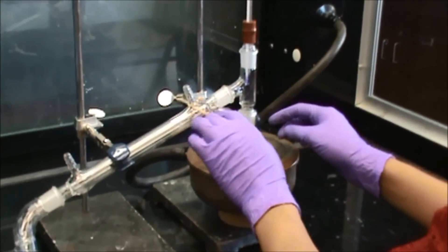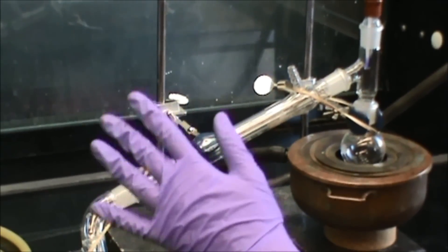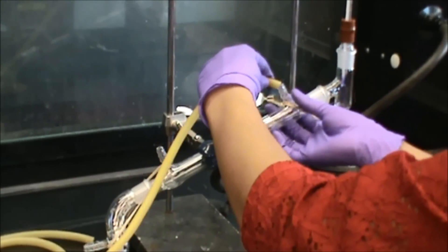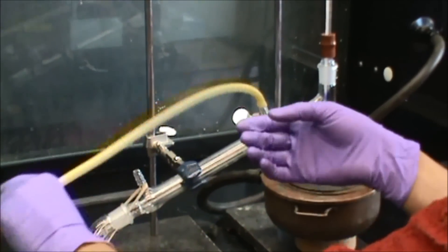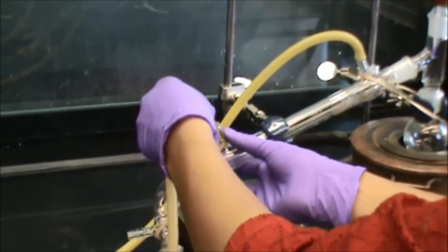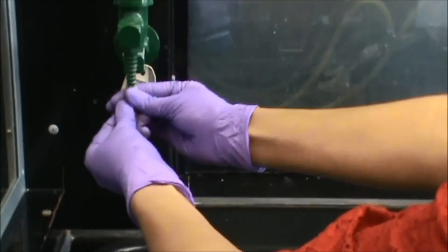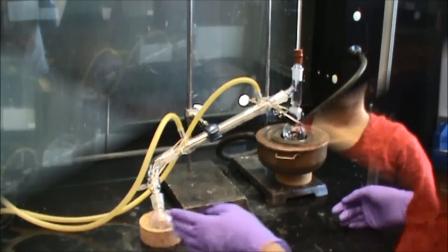Place the rubber band around the opening of the condenser to the distillation pot. You're going to do this to make sure your entire setup is secure and nothing falls apart when you're doing your experiment. Now take your tubes and connect them to the first opening on the condenser. This tube will go to the drain and is called water out. Take your second tube and attach it to the second opening on the condenser — this will go to your water source and is called water in. Make sure all your tubes are properly placed, because when the water starts flowing you don't want your tubes to fall out and the water to spill everywhere.